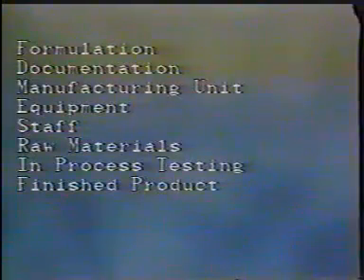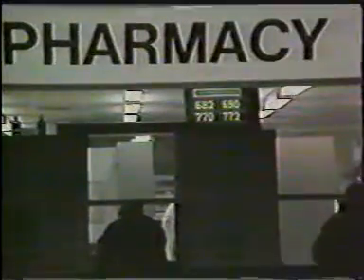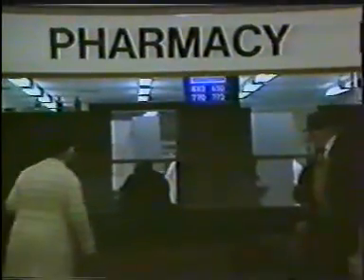Tests may be carried out on the bulk product before packing, and procedures such as bottle washing and bung washing may be monitored microbiologically. The finished product is placed into bond to await testing and released by quality control. Provided that all these steps are taken, we can be assured that we have done everything possible to ensure that the products being made are of suitably high quality for use in patient care.